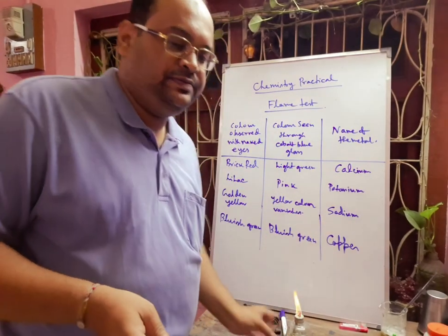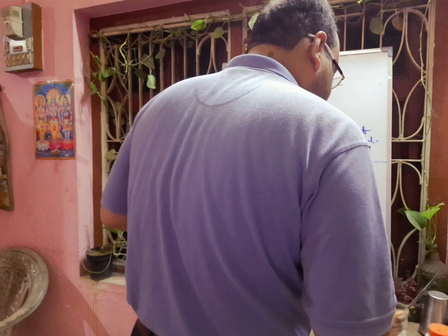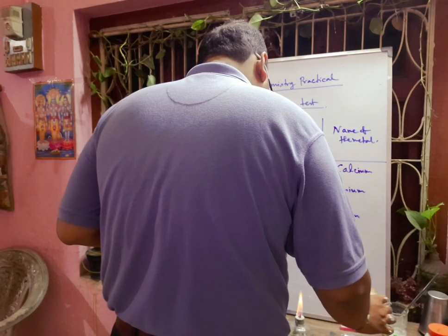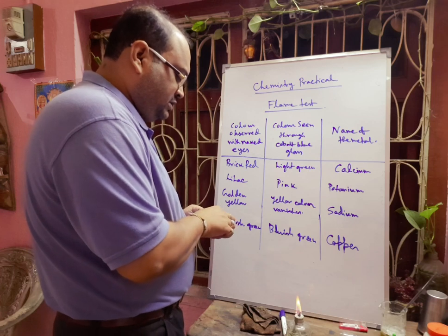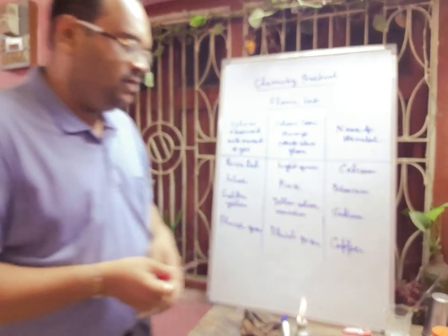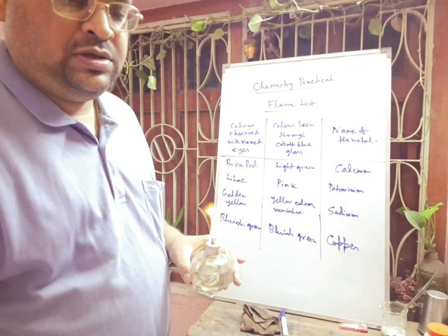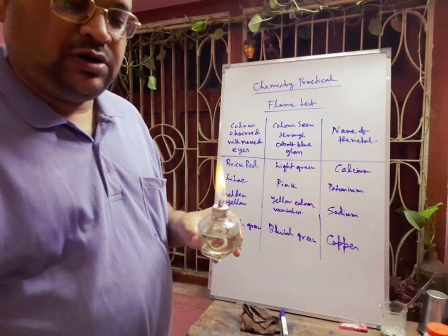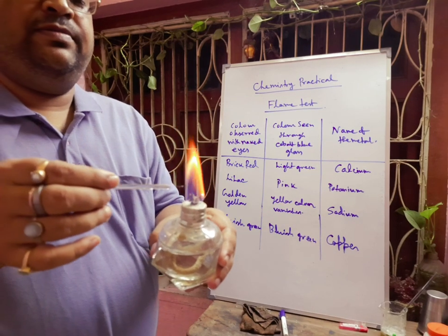Next, one more important salt — copper salt. We have to take fresh HCl and then take some copper salt to make a paste with HCl. That means hydrochloric acid will form CuCl₂, since copper is in the +2 state. Now, taking this copper salt and converting it through HCl, we touch it to the flame.